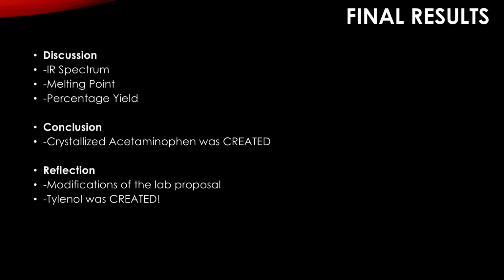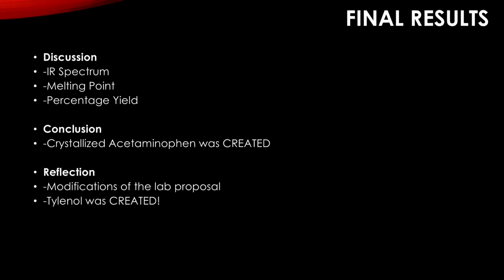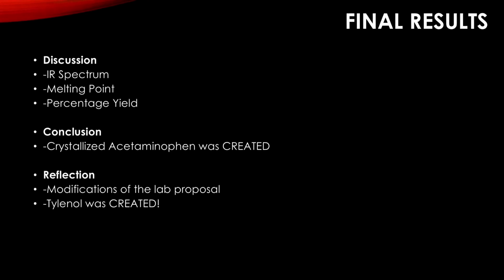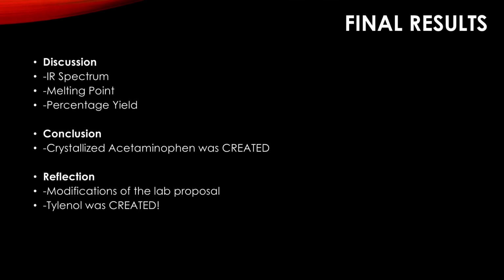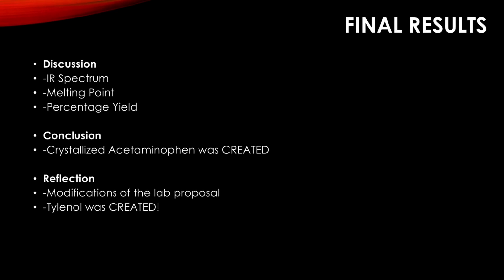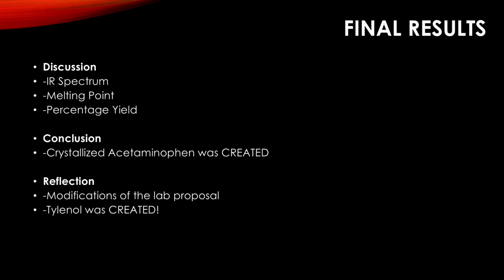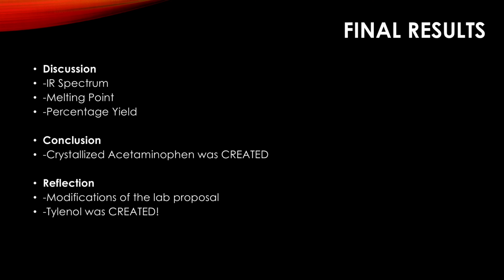As a reflection, this project allowed me to create my own synthesis proposal. I've learned that even though modifications can occur during the lab, I was still able to have an end result of acetaminophen. I was also able to relearn new things about the lab, such as understanding why we needed the salt tablets to get the proper reading in the IR spectrum, as well as carefully watching the capillary tube to melt correctly.